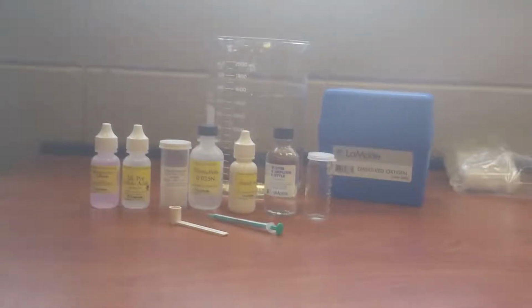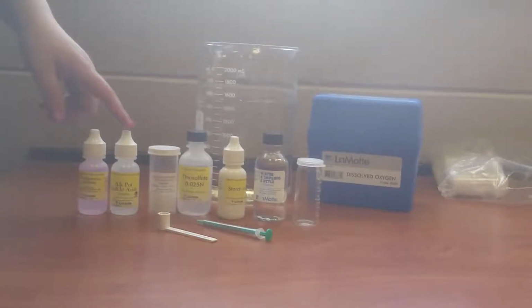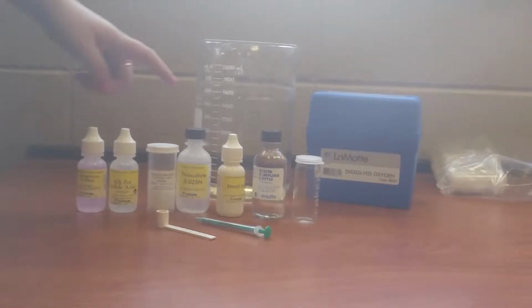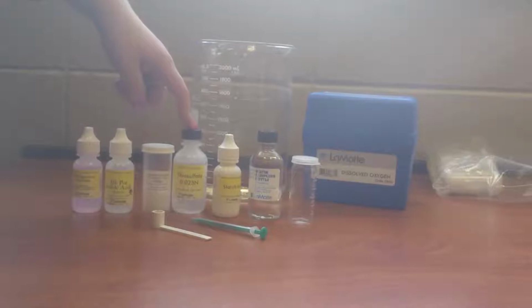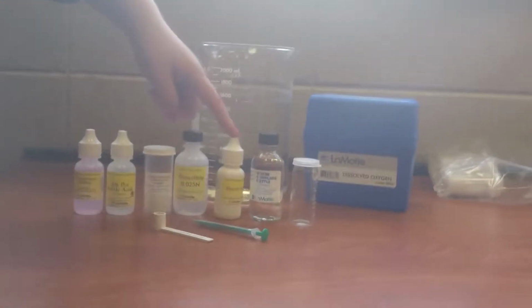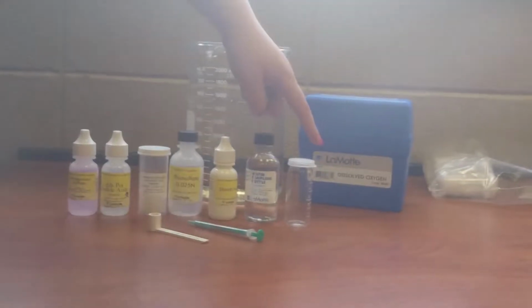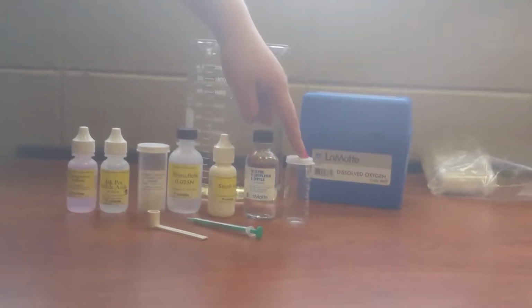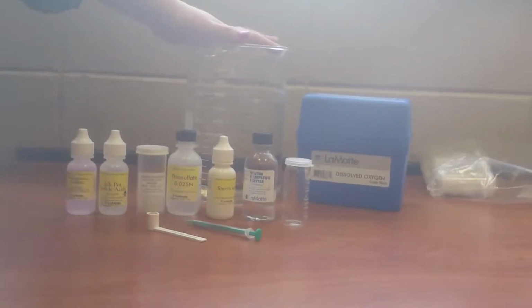For this dissolved oxygen experiment, you will need a manganese sulfate solution, an alkaline potassium iodide azide, a sulfamic acid powder, sodium thiosulfate, a starch indicator, a water sampling bottle, a titration tube and a titration tube cap, a syringe, a scoop, and a beaker of water.